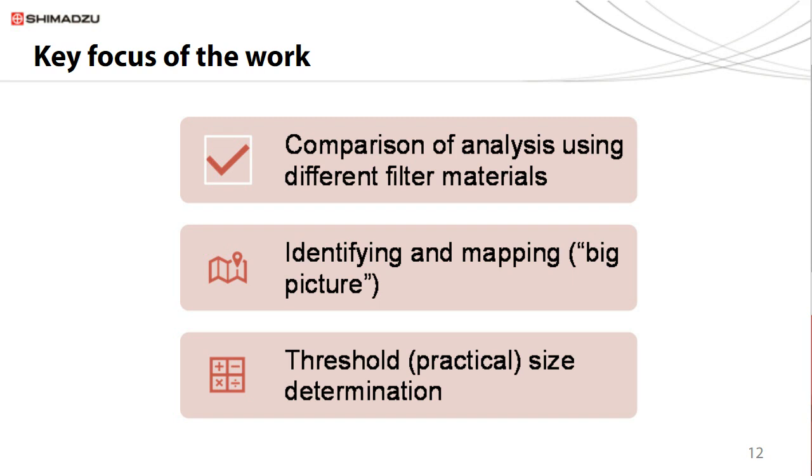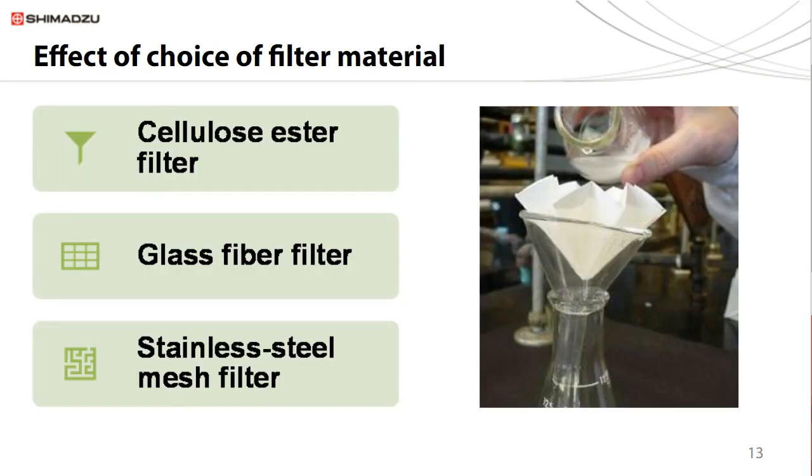Although instrument specifications list the smallest possible measurable dimensions, measurement of the smallest possible sample in a practical setting may be different. Here, we will present two experimental approaches backed by statistical analysis to determine the threshold of measurable sizes in a practical setting, in reasonable time, and with standard measurement parameters.